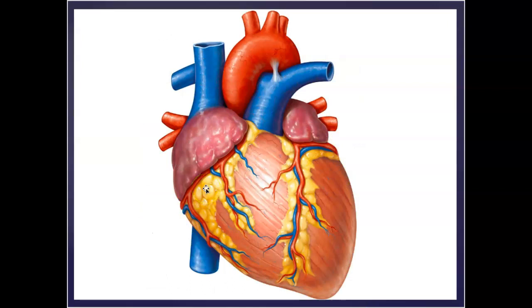This picture obviously is just showing the heart outside of the body. So first thing we'll do is cut the superior vena cava, okay, before it enters into the right atrium. And then again, lifting the heart off of the margin of the diaphragm and cutting the inferior vena cava. Okay, and you'll see that where it punches right through the diaphragm to enter. Okay, and then next you'll need to cut the aorta. Try to cut that before the arch of the aorta.